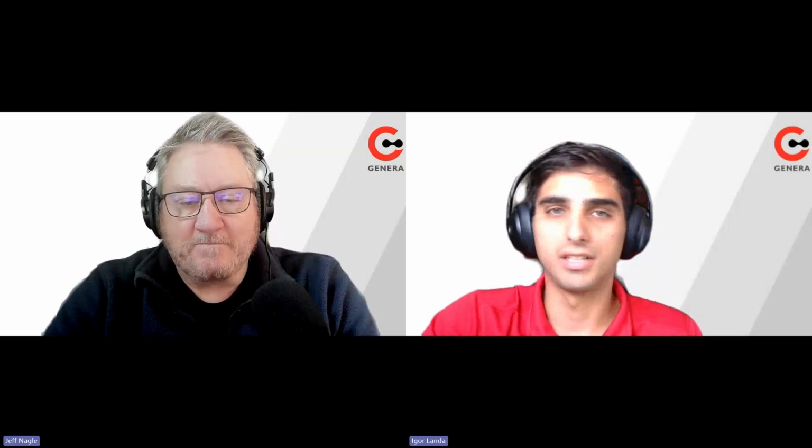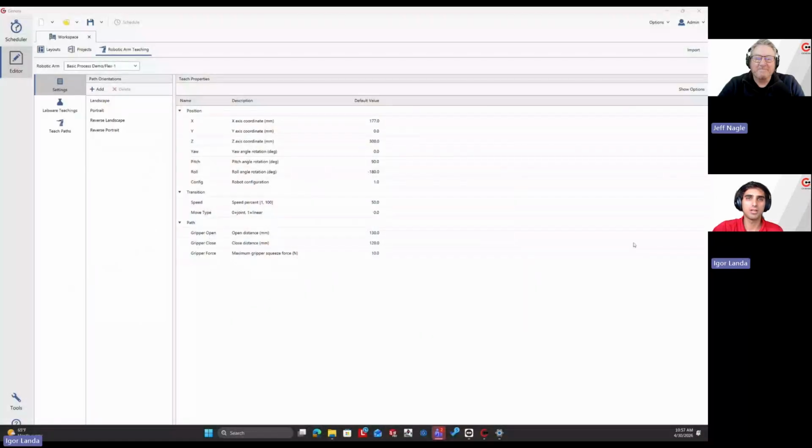And as always, I'm going to let Igor take the lead here and we'll just discuss as we move along. So Igor, have at it. Yeah, this is super exciting to get into because this is where we actually create the science within the software. That's right. If you can remember, Igor's just picking up where we left off last time at the teach pendant because we taught our teach points in the third part of this video series. So this is where we'll begin.